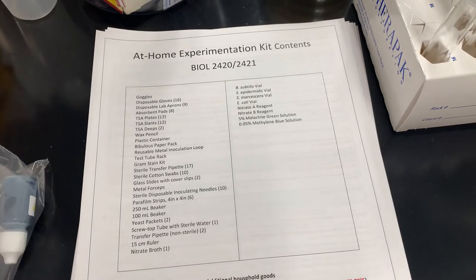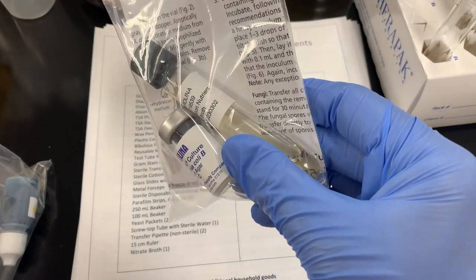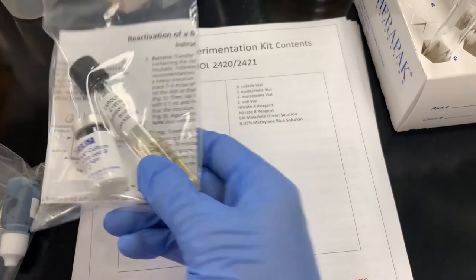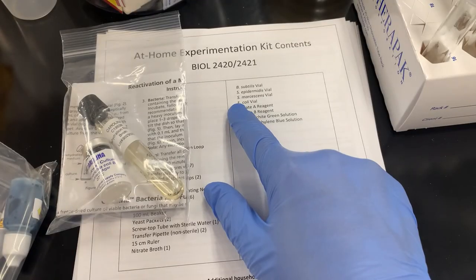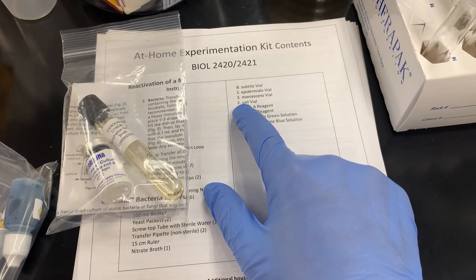We have selected biosafety level 1 bacteria. These bacteria are not going to hurt you unless you are immunocompromised, but you still need to be careful with them because who knows what's going to happen. Now, we have 4 bacteria here for you. It's Bacillus subtilis, Staphylococcus epidermidis, Serratia marcescens, and Escherichia coli. That's right, we gave you E. coli. It is not dangerous as long as you take the proper safety precautions, okay?